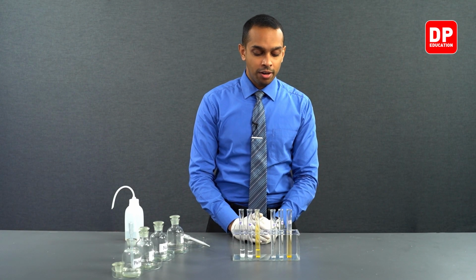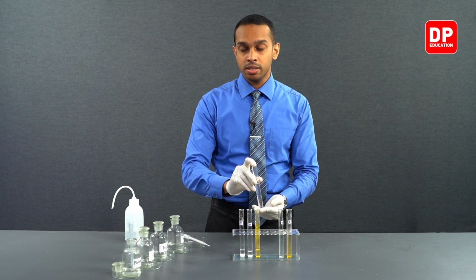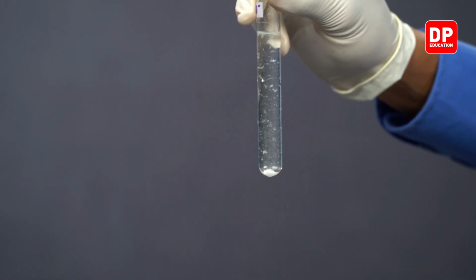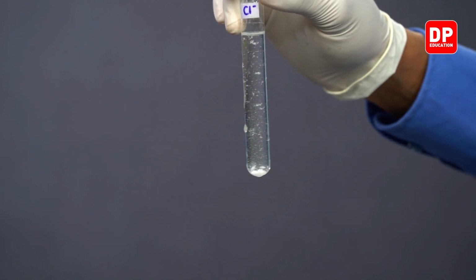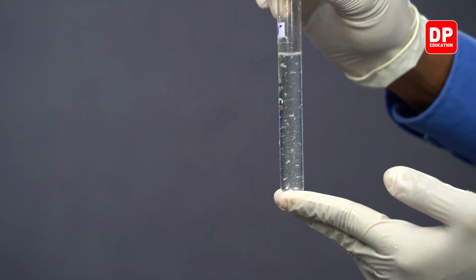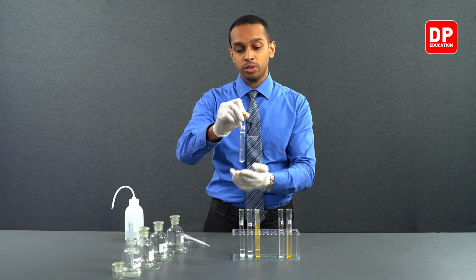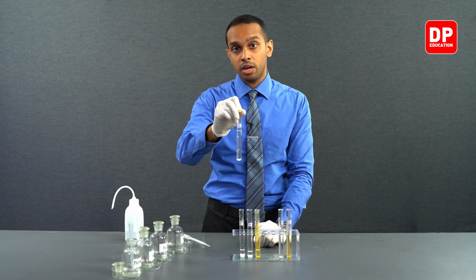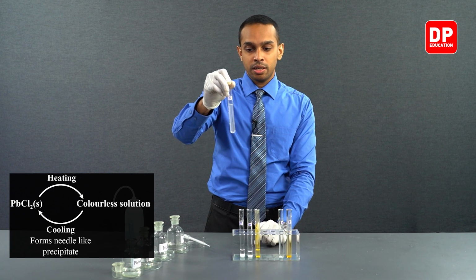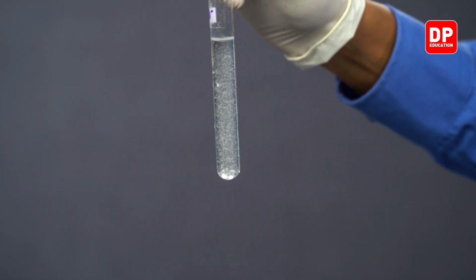Now, we have allowed the solutions to cool down for 5 minutes. You can see there is a small precipitate starting to form when it comes to lead chloride. The hot lead chloride solution is now starting to precipitate out solid lead chloride, which is white in color. If I show you the precipitate being formed, I hope you can see needle-like white color precipitates.